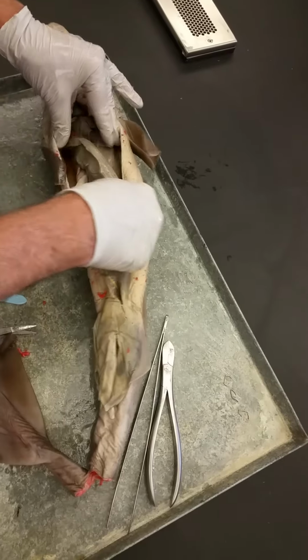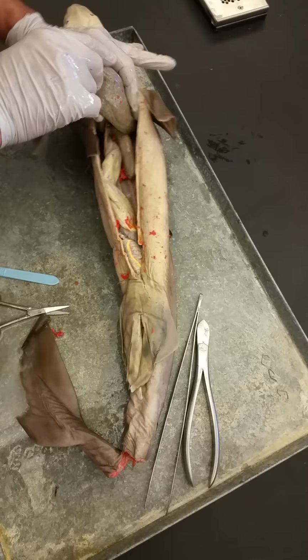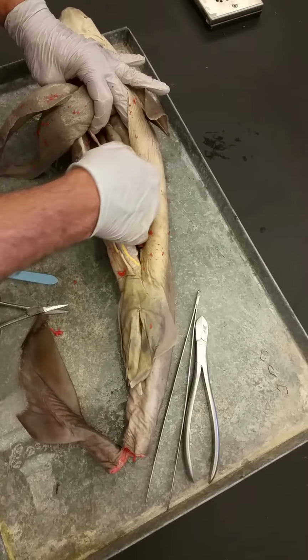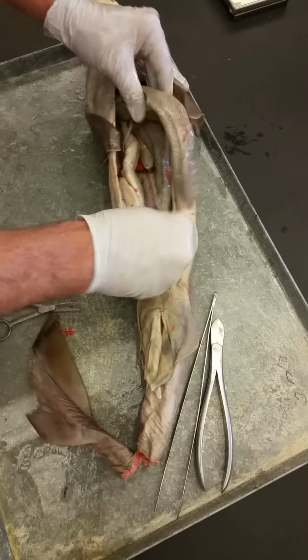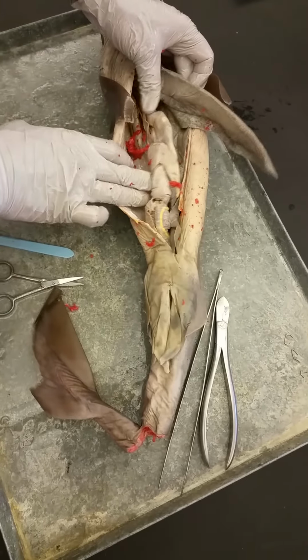Okay, let's see. So we did liver, gallbladder, spleen, stomach. Again, all sharks are carnivores, so we don't really see much in the way of fermentation structures that you'd have in an herbivore. So not a whole lot in the internal organs.